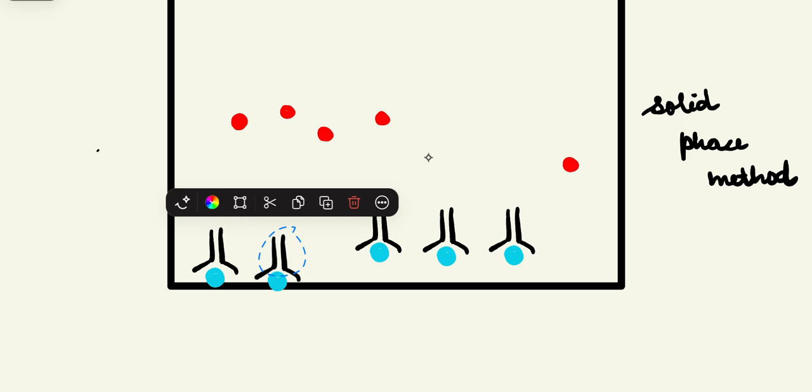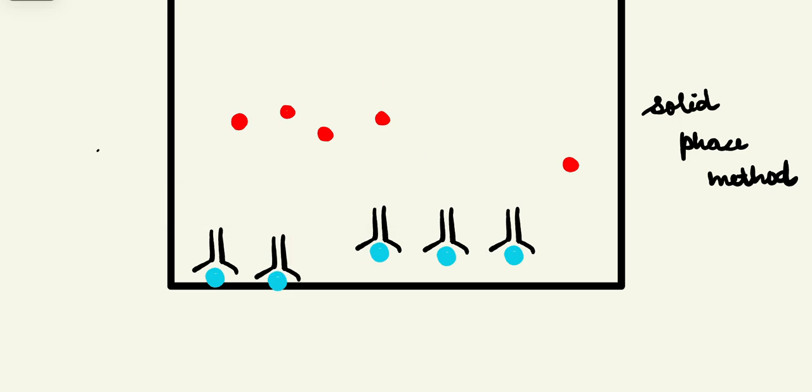Or another alternative which can be done is that we can take what we call sepharose beads. So there are some sepharose beads, let us try to draw them.